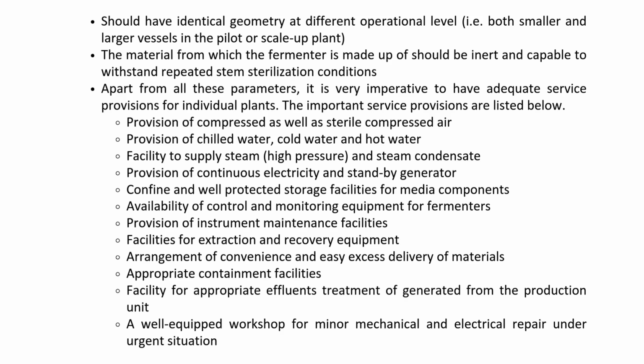The material it's made from must be inert and withstand repeated steam sterilization. Adequate service provisions are also crucial. These include compressed sterile air, chilled and hot water, high-pressure steam, a reliable electricity supply, storage for media, monitoring equipment, maintenance facilities, and effluent treatment systems.